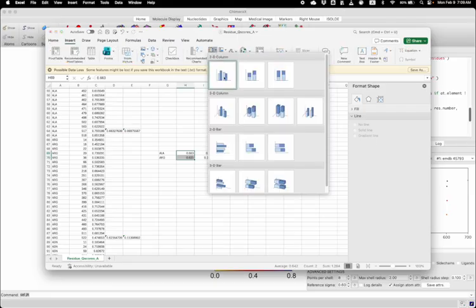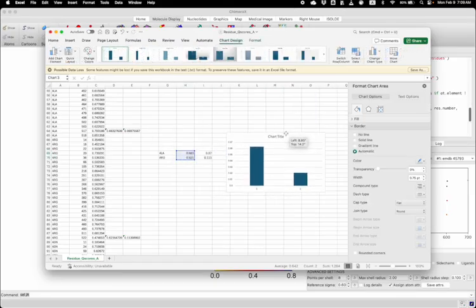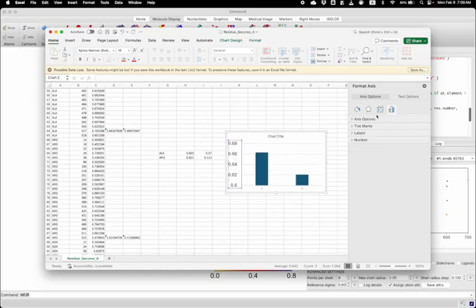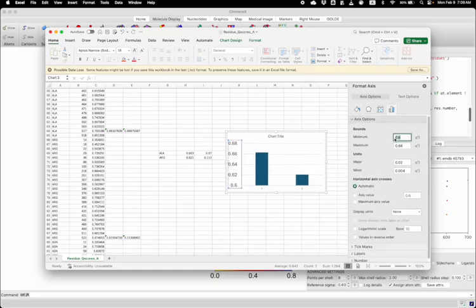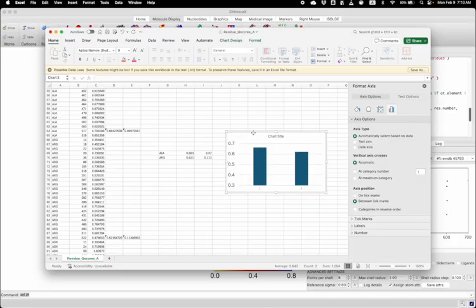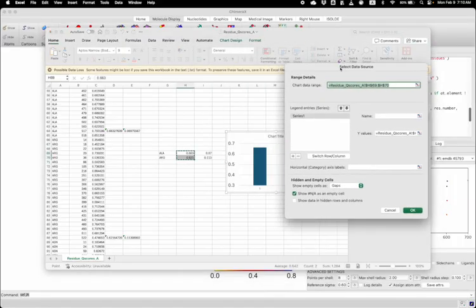In this case, I can use a bar plot. And then here I can control the range. So I can go back to something a bit lower. So they're pretty similar, but there might be different variations for different types. And here I can set the labels to be the names.